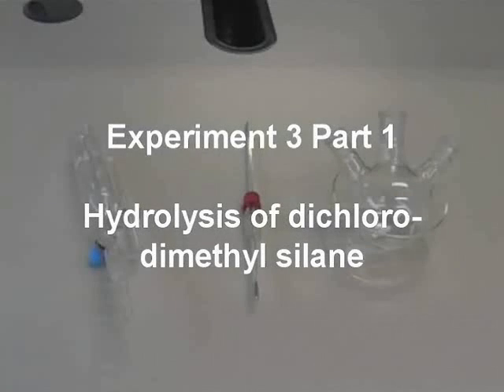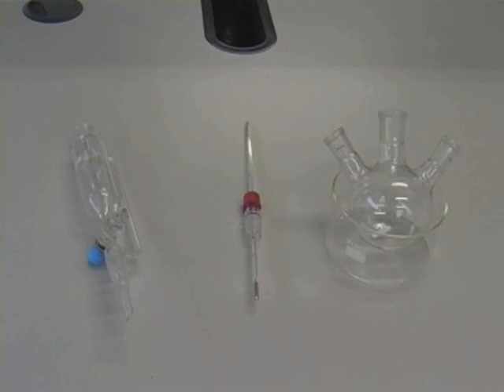The apparatus required for this preparation is a 250ml three neck round bottom flask, a thermometer in a holder, a pressure equalising dropping funnel and a glass bowl.